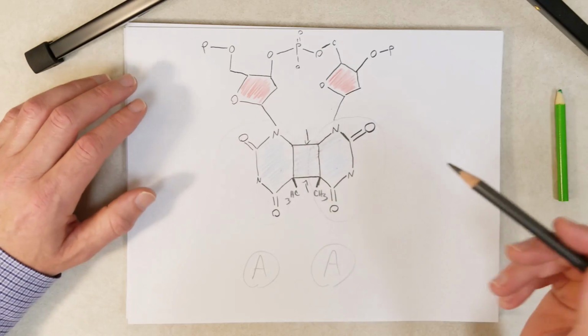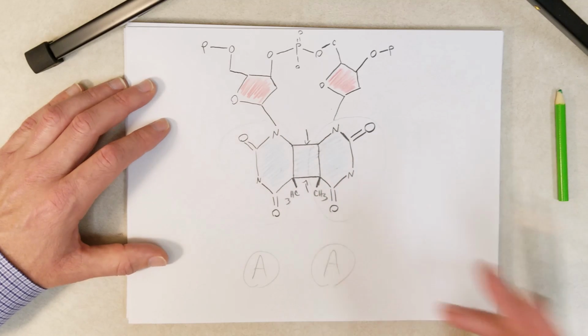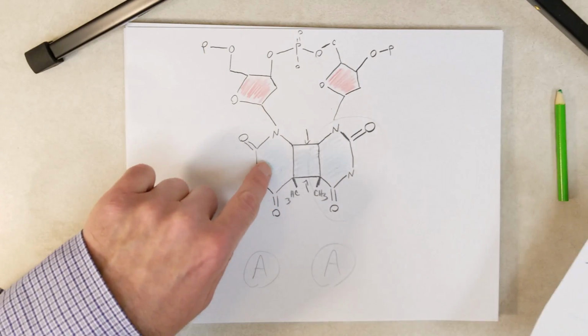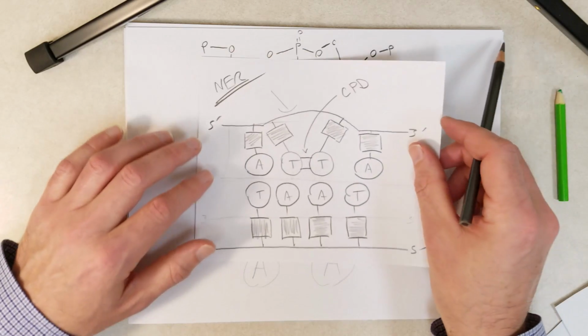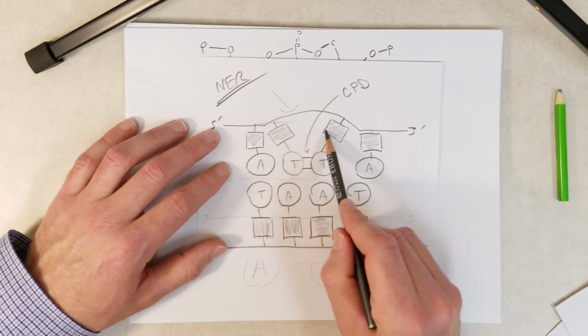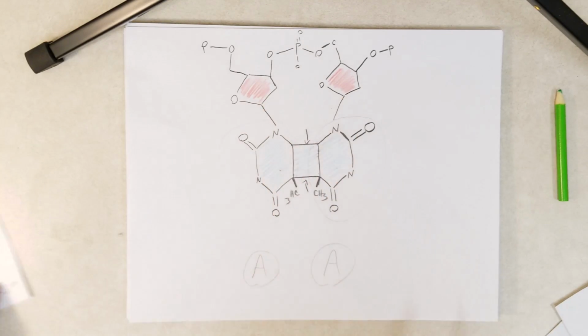Okay, everyone. So here is a more detailed diagram. These are the two thymines. This is the cyclobutane that formed between them. So we're looking at these two thymines, two sugar molecules.